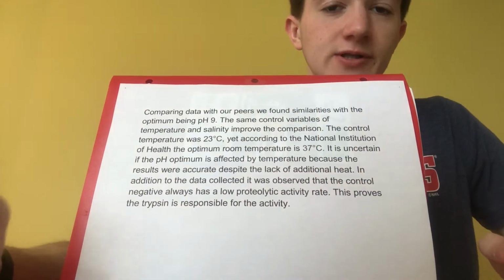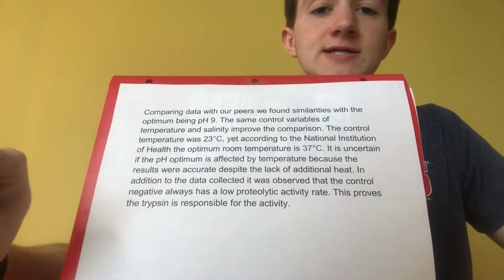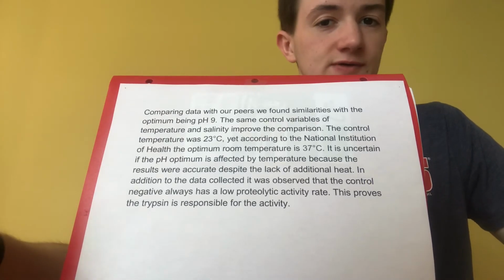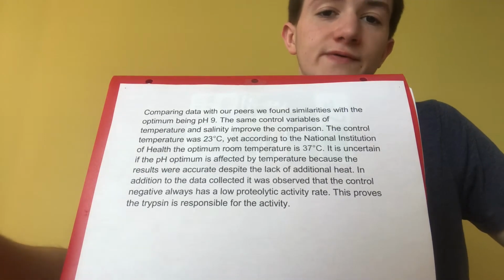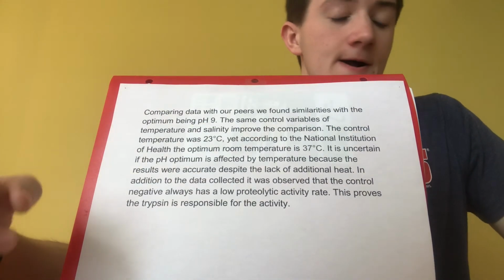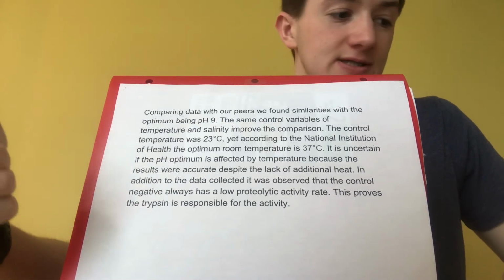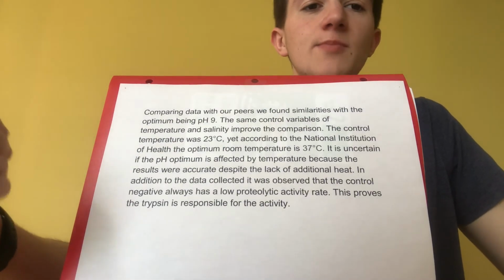Two sources of variability could have been that once the incubation period was over, we did not put in the TCA fast enough, and that could have increased the activity since the reaction didn't stop in time. Another source of variability could have been that not all of the undigested substrate was put into the pellet when we centrifuged, and that means our absorbance would have been off. Improvements to this experiment could have been a warmer room, so maybe the activity could have increased, and maybe more practice with pipetting since it was our first time using the pipettes.